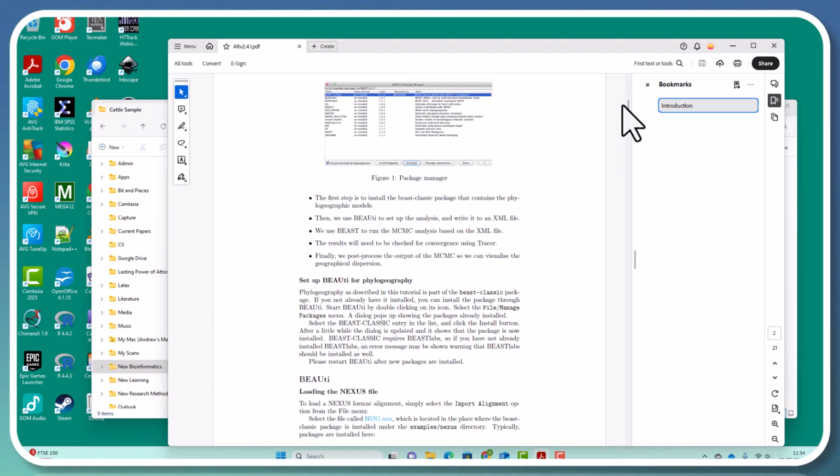And the process is you have to start with an alignment. If you've got a smallish alignment with a limited number of sequences, I would align with MUSCLE. For a larger number of sequences, considering these are viral sequences and all very similar to each other, MAFFT will do a perfectly fine job in a reasonable amount of time.